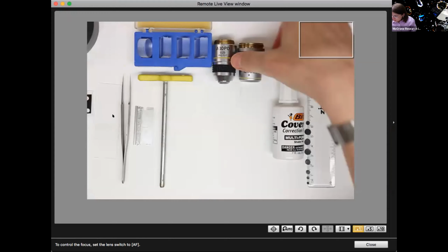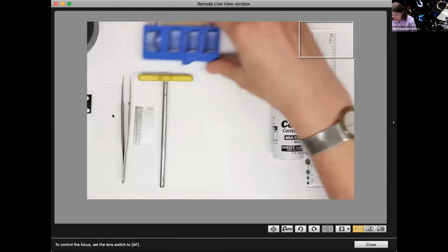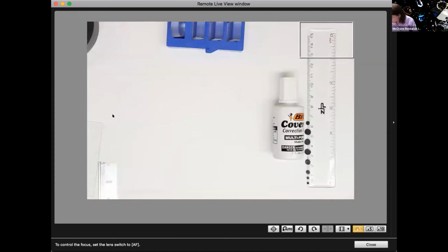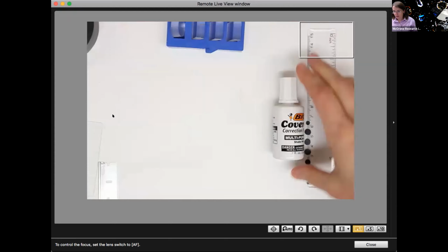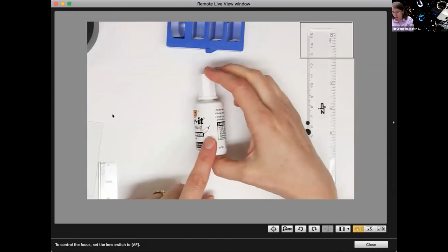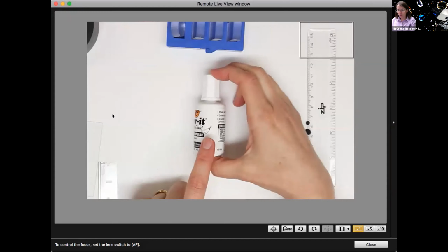So if you're going to make a stop with correction fluid, what I would certainly recommend, first of all, is the style that uses the brush applicator. Many of the ones that are made now actually have a foam wedge applicator, and it's really hard to get a round spot from a wedge-shaped applicator. So you can try, you might be able to get something, but these are better.